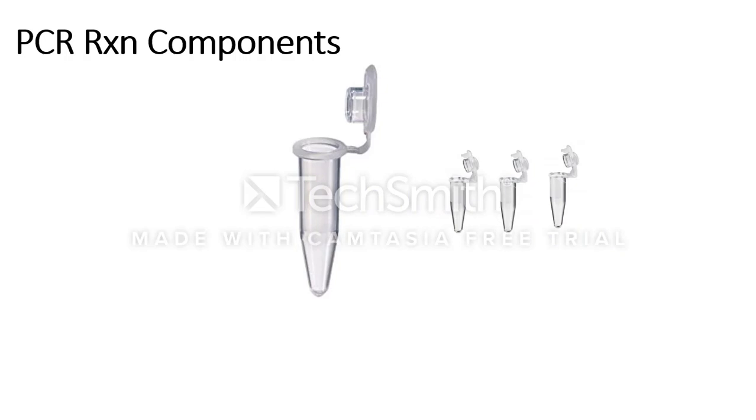The reaction is then placed in a PCR cycling machine that goes through a series of denaturing, annealing, and extension steps in order to effectively replicate your desired gene of interest.